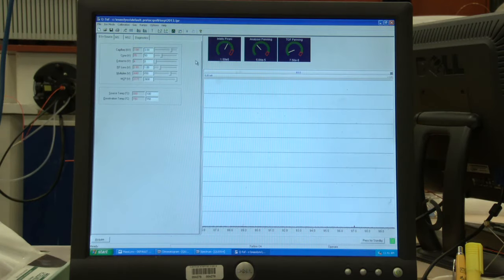Each manufacturer has their own brand of software for each instrument. Here you can see the voltages associated with the source, the detector voltages, and the source temperature controls. Adjusting the source voltages and temperatures and also adjusting gas pressures are all parameters that will need to be optimized to produce the best ionizing conditions for individual molecules.